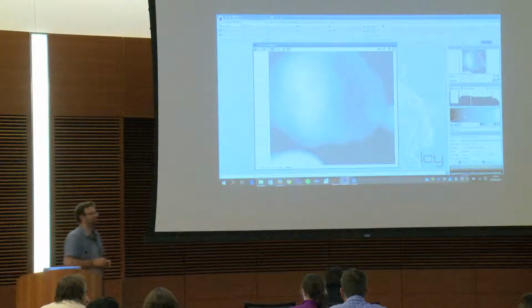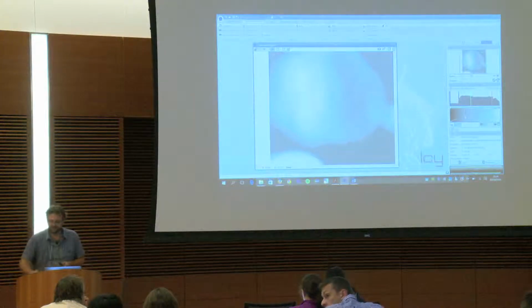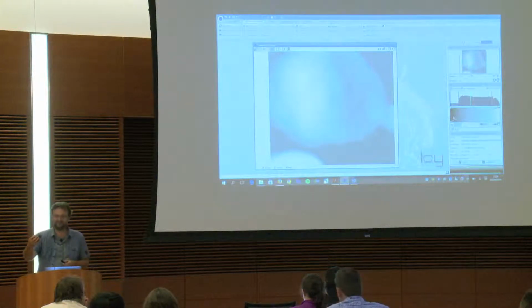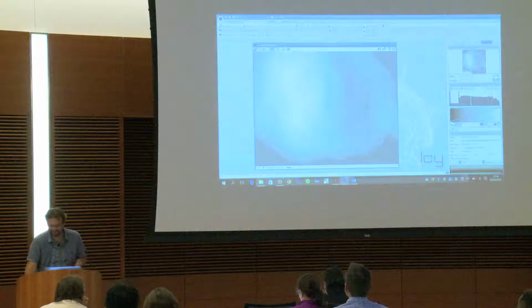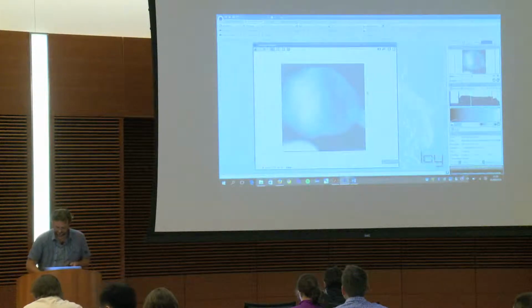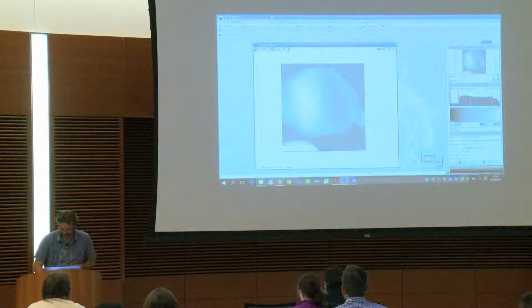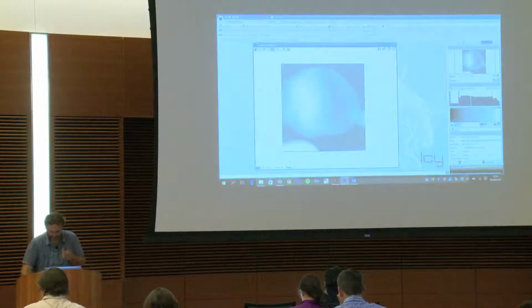So, okay. What's the shortcut for zoom? It is this thing here. But yeah, if you can't play with this, here you have a zoom functionality. And you can go to a specific one, but if you are using a trackpad, usually, not on this one, but on this side, you also have the emulation of the mouse wheel.